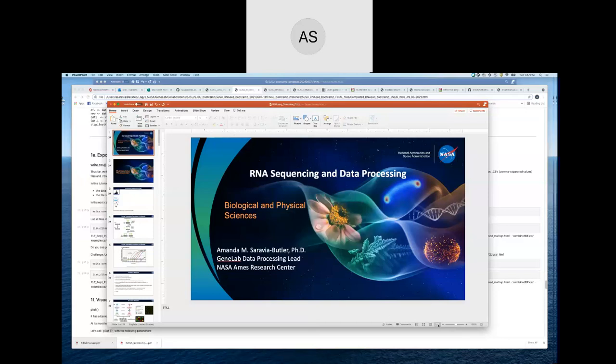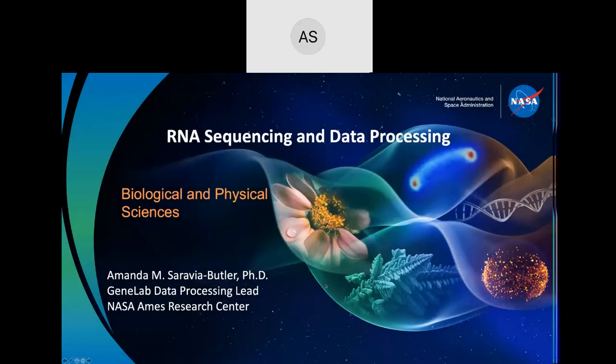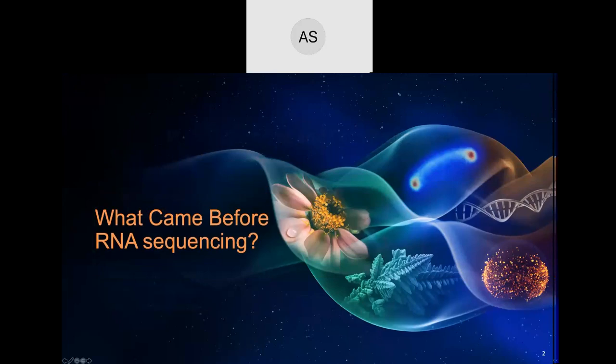Okay, so this is officially moving into why we are all here, which is going to begin to talk about RNA sequencing and ultimately data processing, which is what we're going to be spending the rest of our time together doing. So let's first give a little background about what came before RNA sequencing.